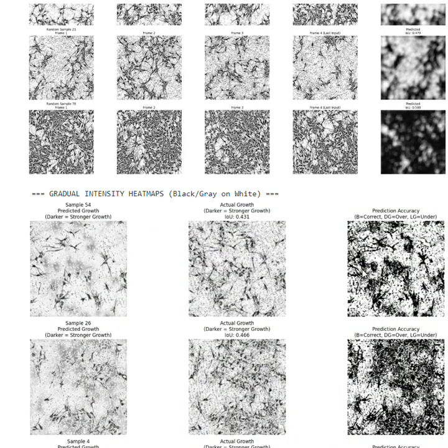And this is the image merged, which means the predicted image and the actual image merged into the final image here, showing which are being predicted and which are being predicted falsely.